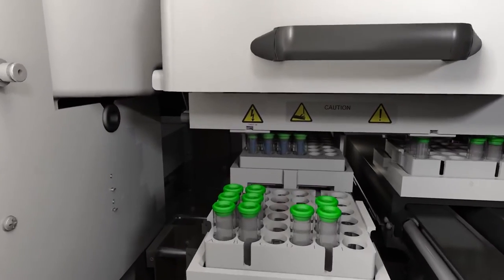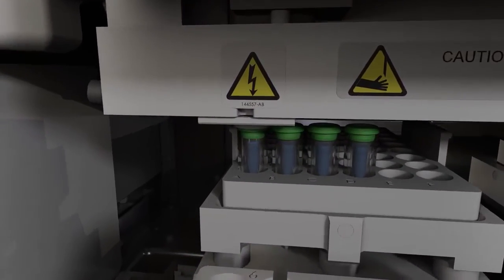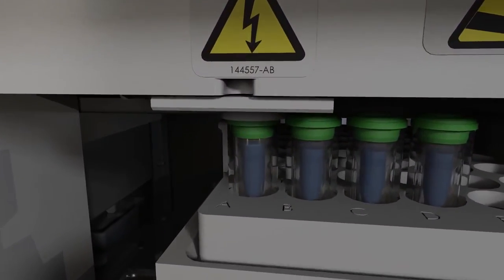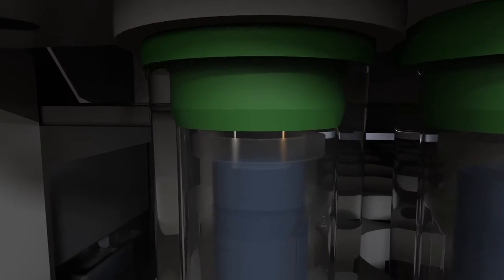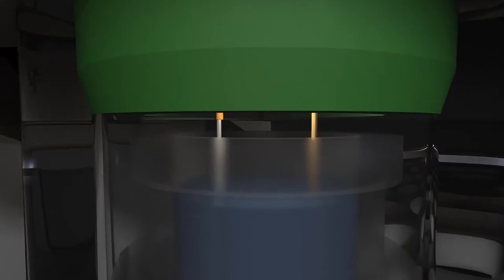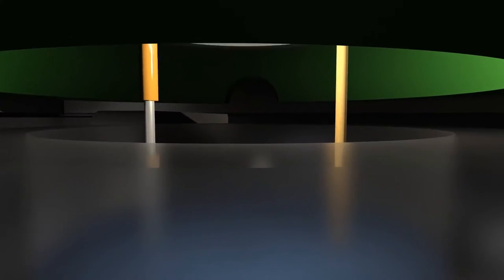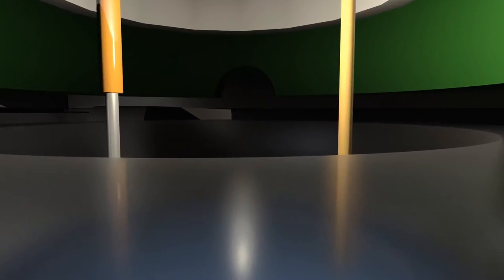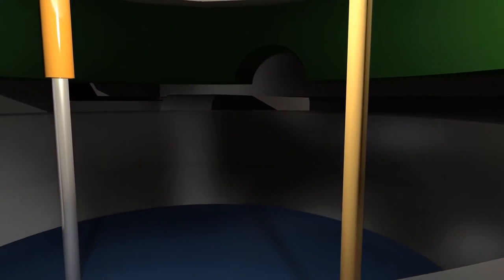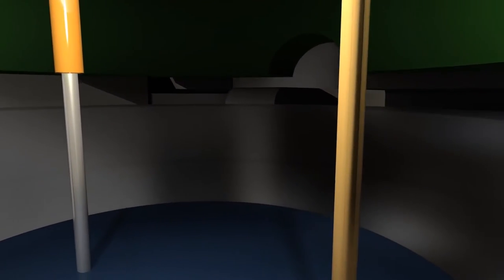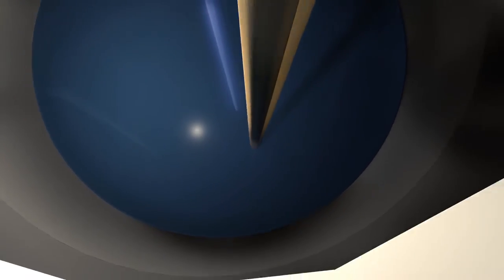You've worked hard to get your sample this far. Only a minute amount is introduced into the capillary, leaving most of your sample available for other experiments. An electric field is applied and your sample is separated into its components based on their mass and charge.